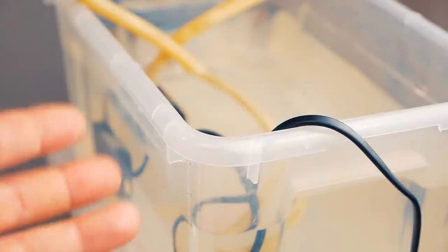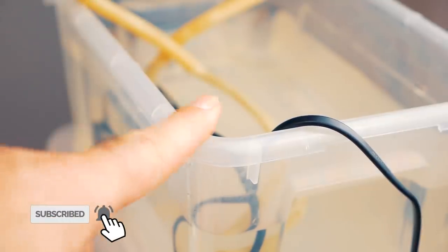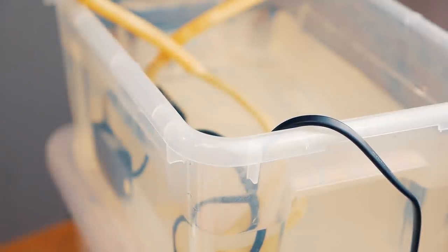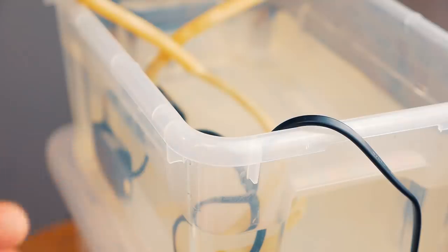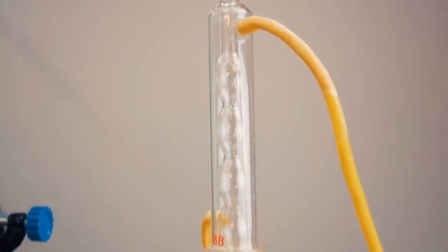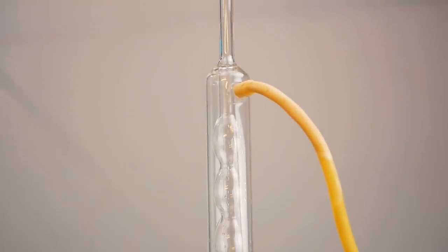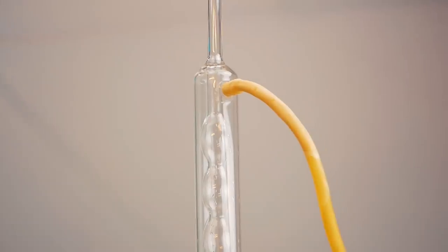Here we have a bucket of water which is going to help with the condensing of the ethanol. I'm going to put in some ice so we get this water a bit cooler, and that's going to help the ethanol condense. It's using a cheap pump over here, which is just a small aquarium pump, and I have it raised quite a bit because it is a cheap pump, so it can't really pump water too high. Here's the condenser. We have water coming in at the base and it's going to pump up and it's going to come out at the top there and it's going to keep recirculating. Let's turn the pump on and get that started.